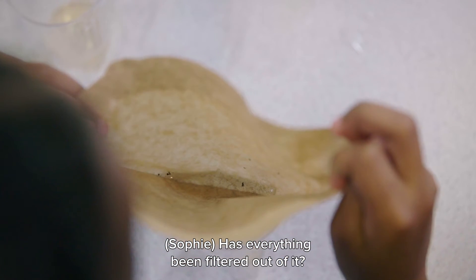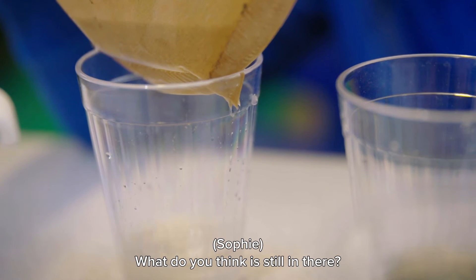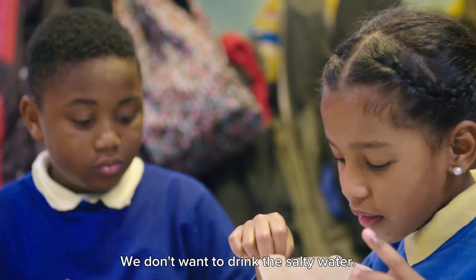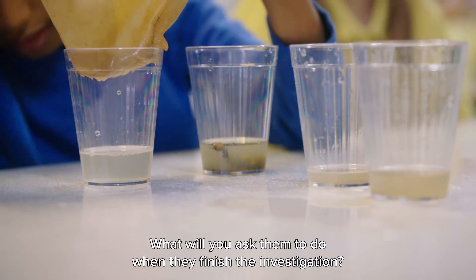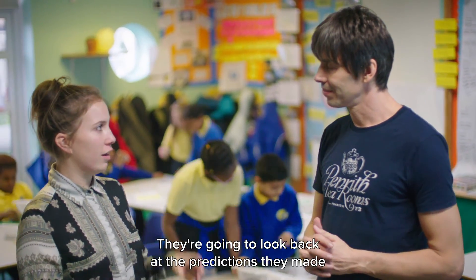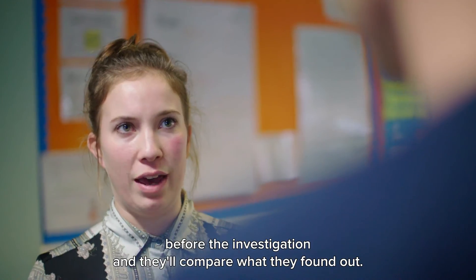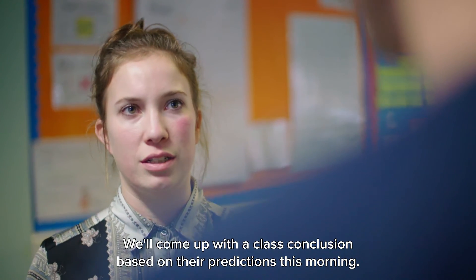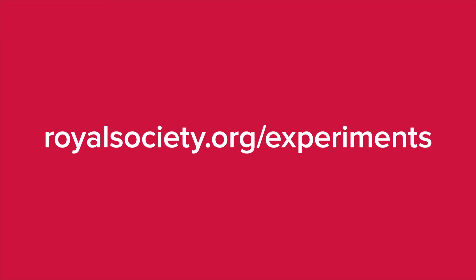Has everything been filtered out of it? No. What do you think is still in there? It's not going to be that clean because it's still got salt in it, and we don't want to drink salty water. When they finish the investigation, we're going to have a class discussion. They'll look back at their predictions made before the investigation and compare what they found to those predictions, then come up with a class conclusion.